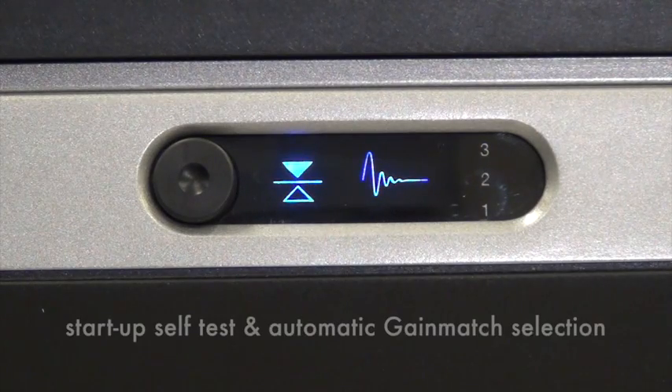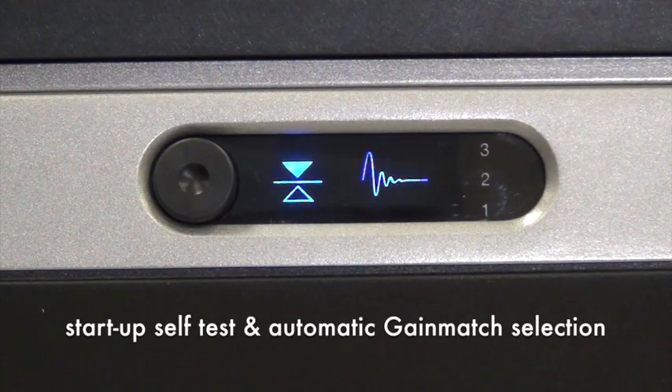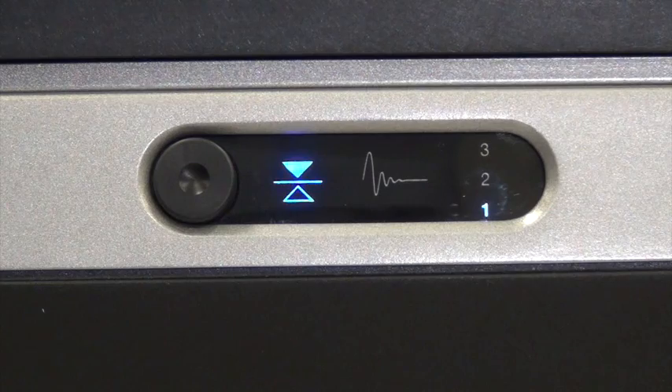The system then initiates a startup self-test and automatic gain-match selection. This process typically takes two minutes, dependent upon leveling time. During this process, the isolator indicator will turn on and off while each gain-match level is tested, as indicated by the flashing number.